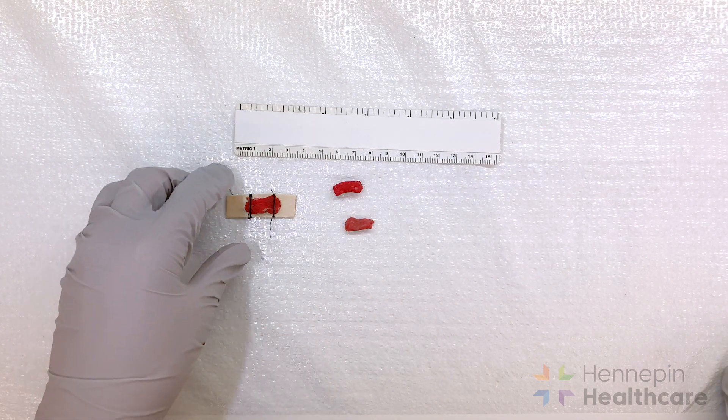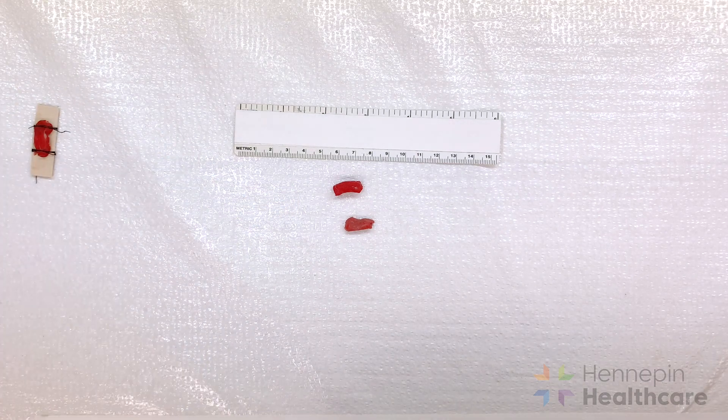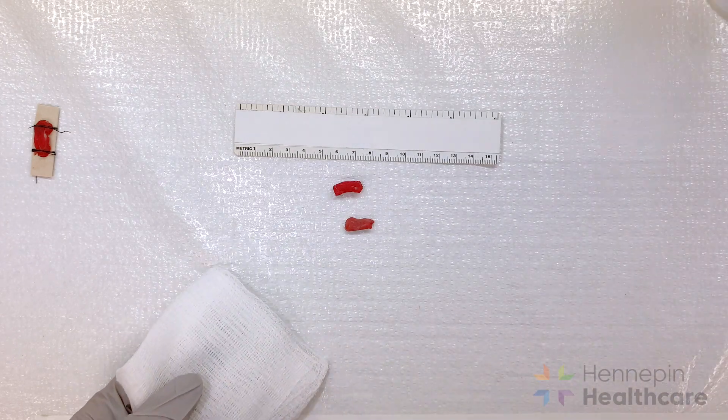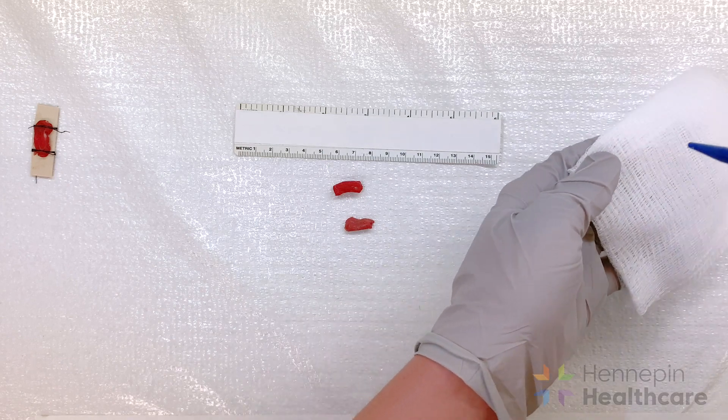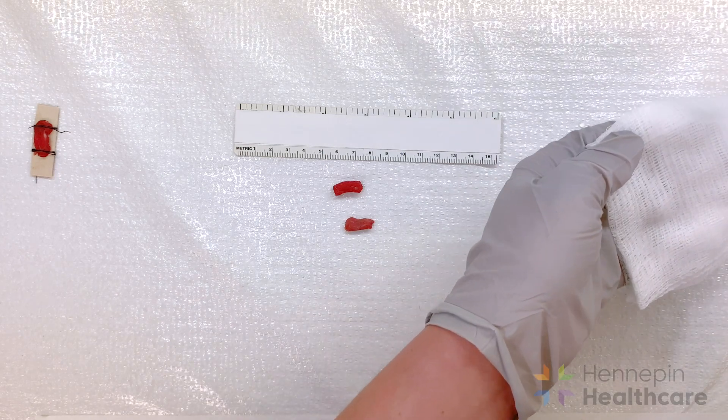Let's begin with the fresh tissue. It can be helpful to lay the tissue on a tongue blade before gently wrapping the tissue in saline moistened gauze. The gauze should be completely moistened with isotonic saline but not dripping wet.